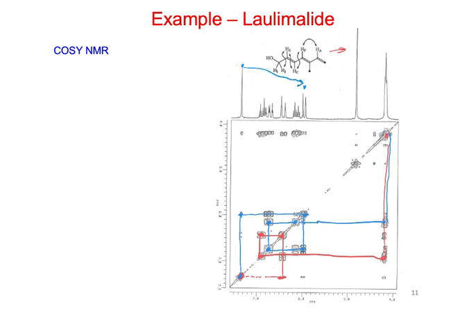So that was A to F. From there, we went to here, which is HC, right? And then HC went back to here, which is G. And from there, we went to the CH2s. Right, so it's pretty easy in this one to just walk your way down the spin system in both directions.